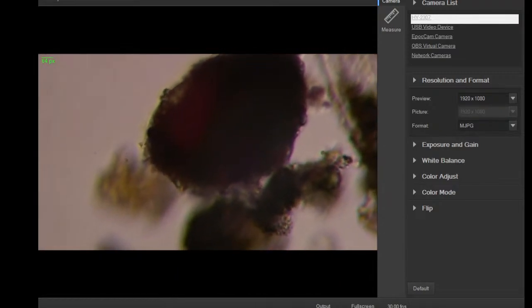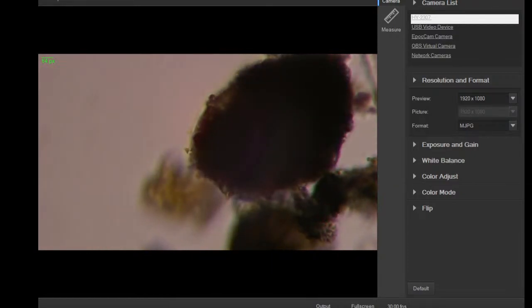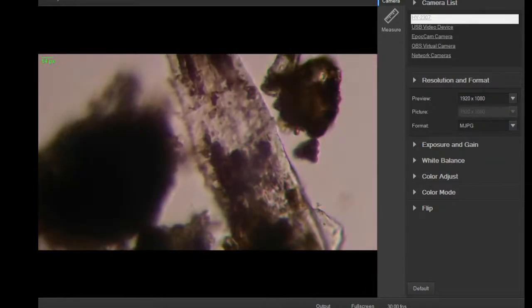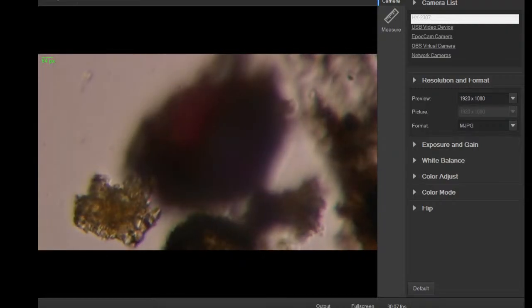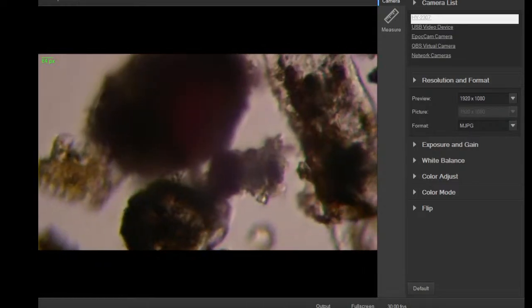Alright, there we go. And what's interesting is when they, in the older videos I shot, when they do eventually succumb to some form of death, either from age or the heat of the lamp or whatever caused them to die in a few of my streams, you'll see that the cell will rupture, contents will spill out. The cilia continue to beat on the outside of the cell, and the contents spill out, and it takes a while for the vacuoles to pop. Actually, they last for quite a while.